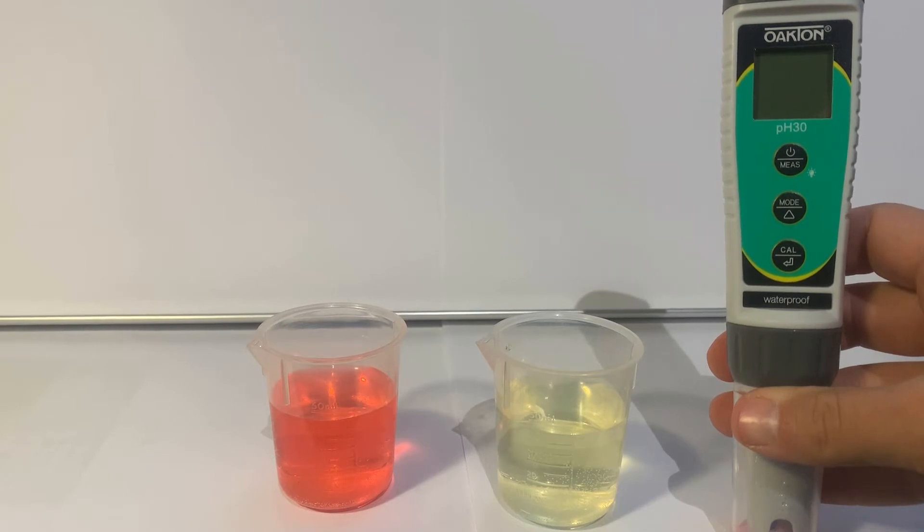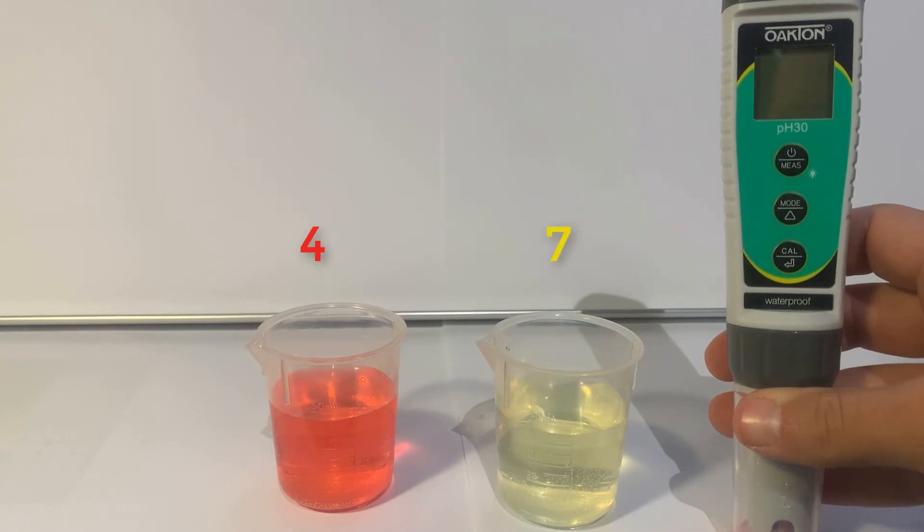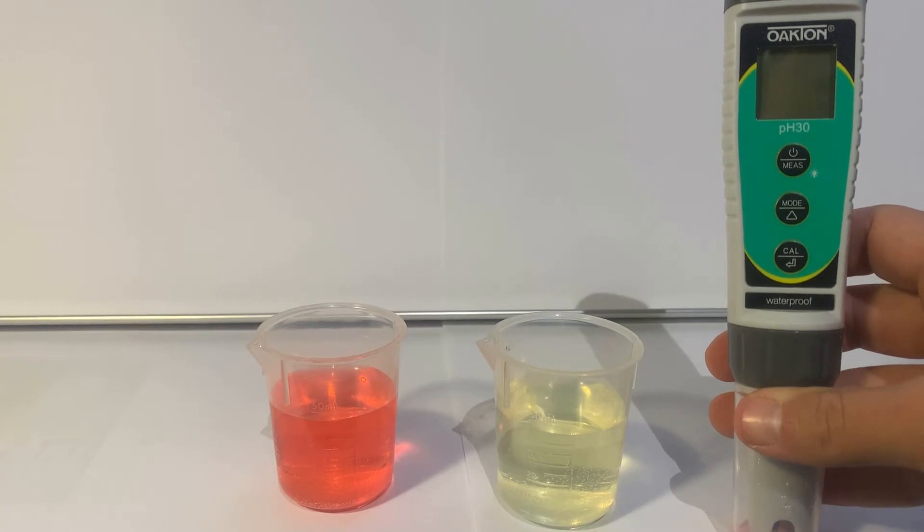Today we are using Buffer 4 and Buffer 7 to calibrate. 4 is in red and 7 is in yellow. Make sure that you use the solutions that bracket your normal reading when you calibrate.